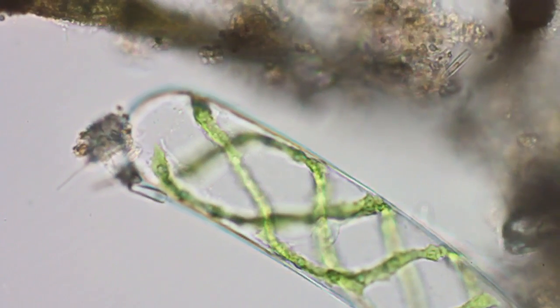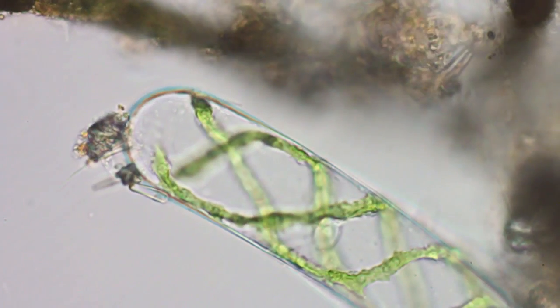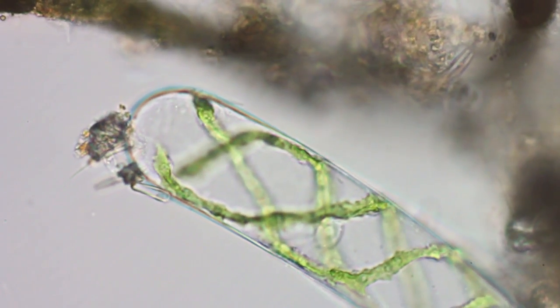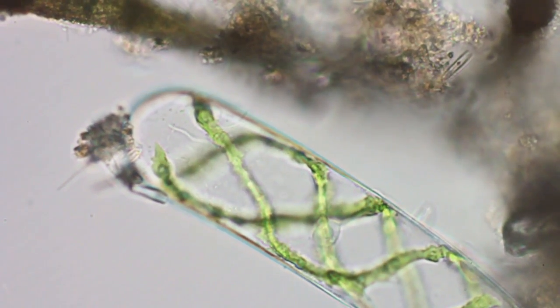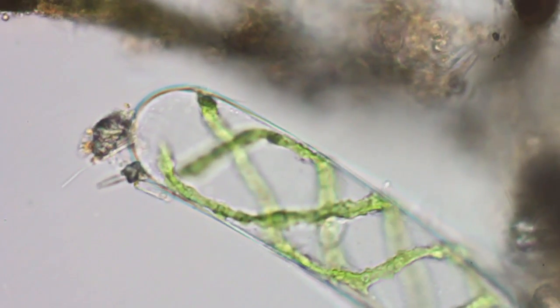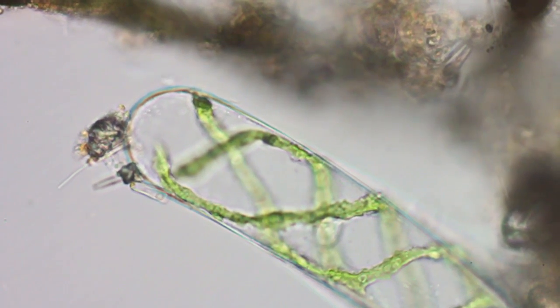There's another nucleus right there, about halfway between the end and the cell wall - out of focus now, and coming into focus right there in the middle, and there it is. And we're winding down to the end of the movie here.